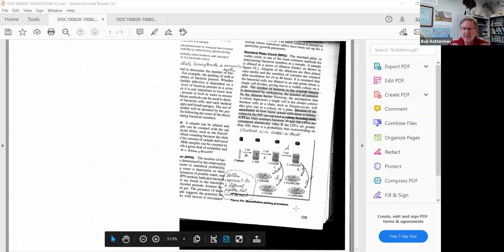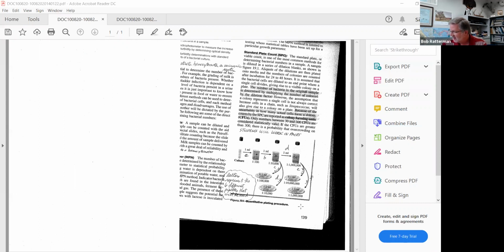These 4 plates are then incubated. They're inverted and placed in the incubator, and the students are going to be looking at those maybe today for the Tuesday group or tomorrow for the Wednesday group. Or if they can't get in the next couple of days, Deb's going to pull those plates, as well as these tubes and the other plates. All this stuff is going to go in the small refrigerator on the right-hand side of that pair in the back of lab, so students can access this.